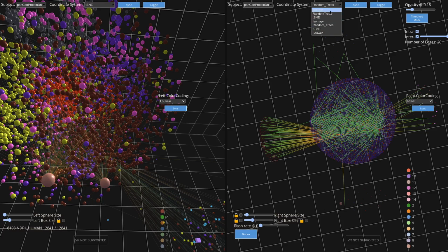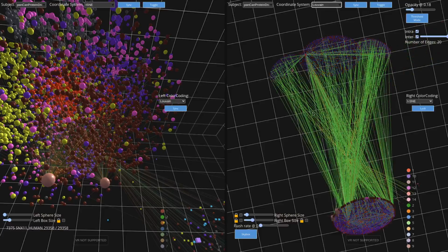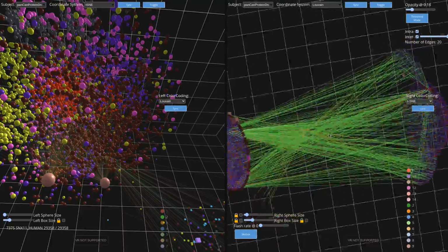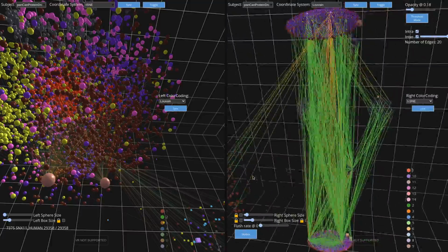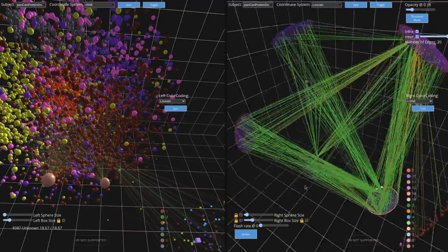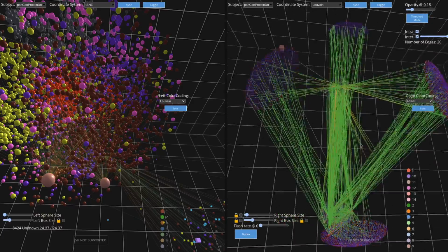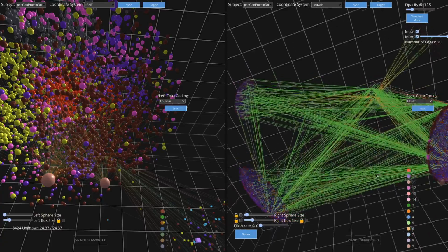So you can see random trees there, and maybe the Louvain modules. It lays out the nodes in sunflowers on the faces of a platonic solid with the appropriate number of faces for the number of clusters that there are.